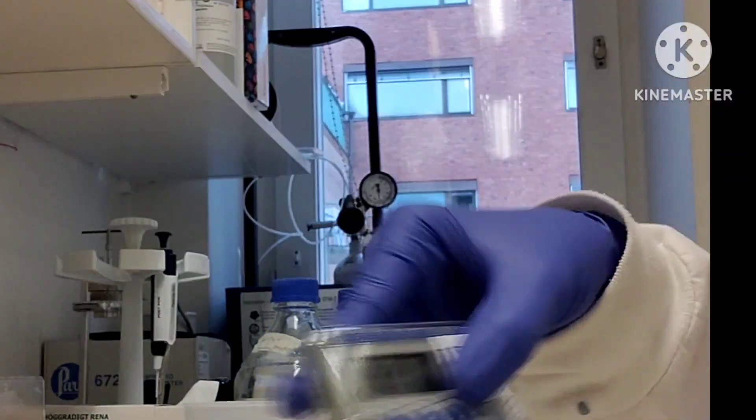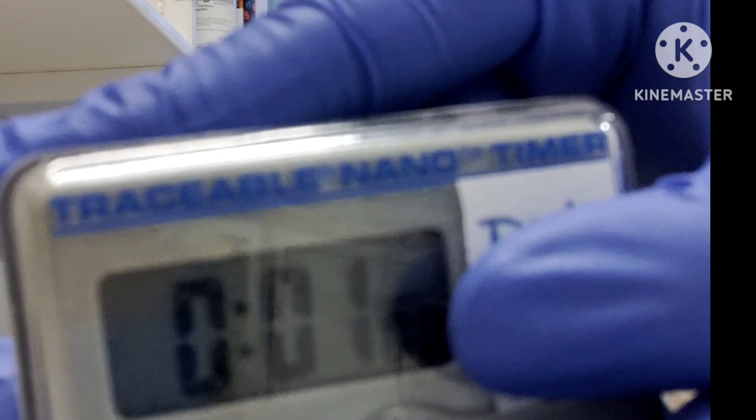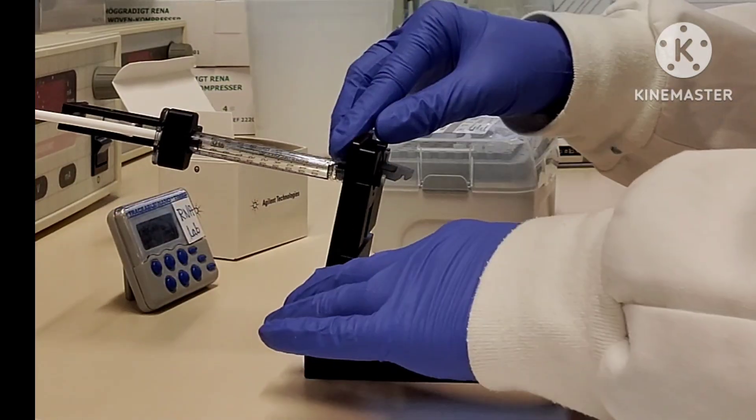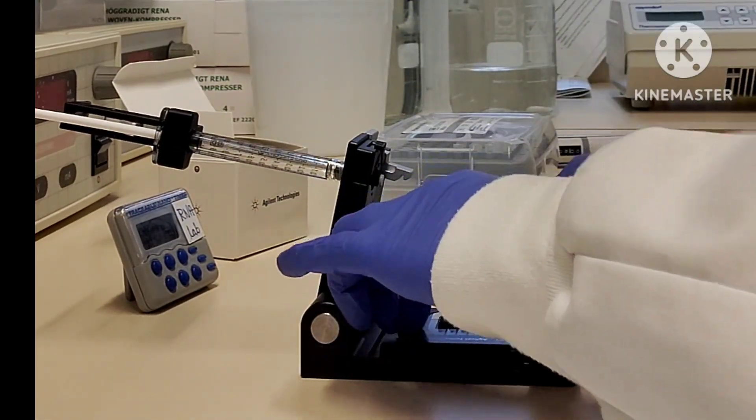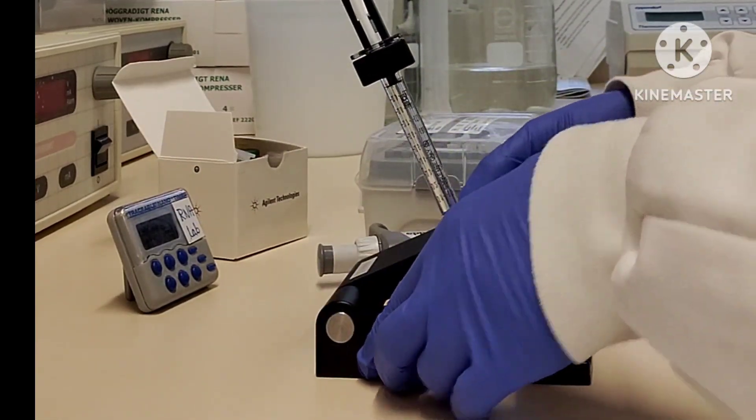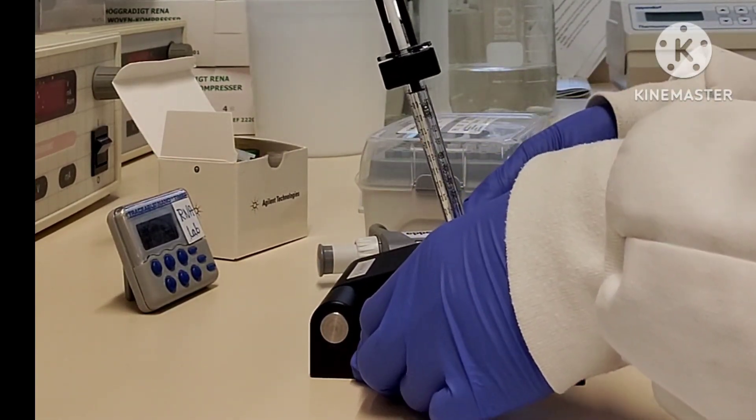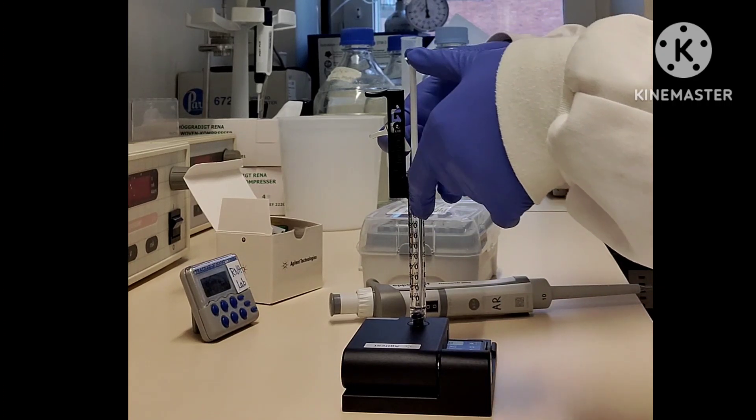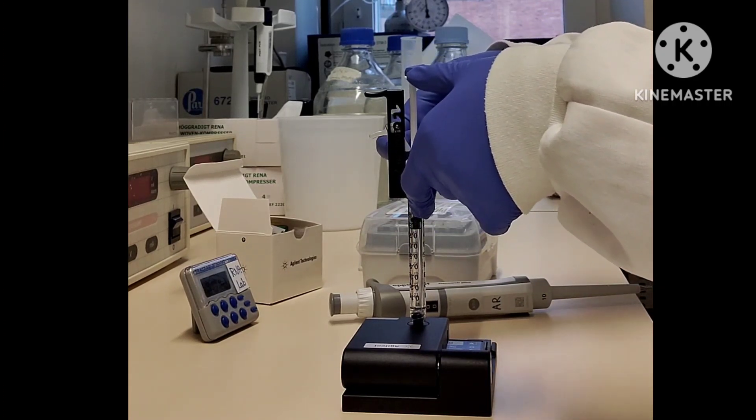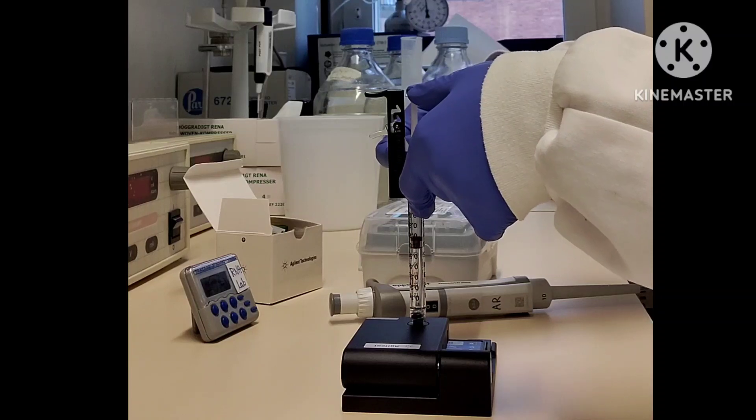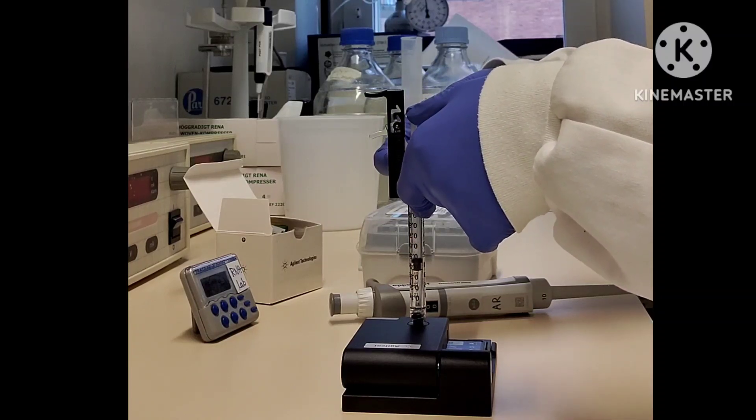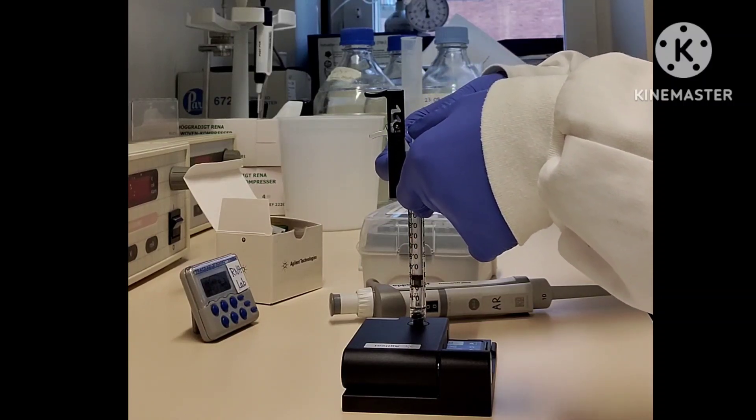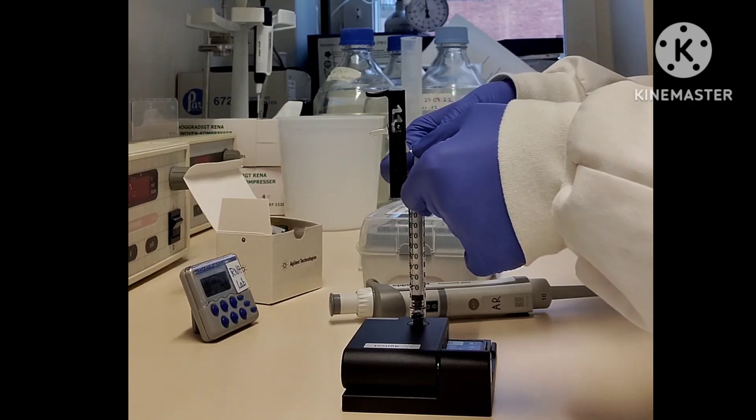Now make sure your timer is set at one minute—do it beforehand. Close the chip priming station; once you close it, you will hear a click sound. Now press down the plunger of the syringe until it is held by the clip, then start the timer for one minute and just wait.